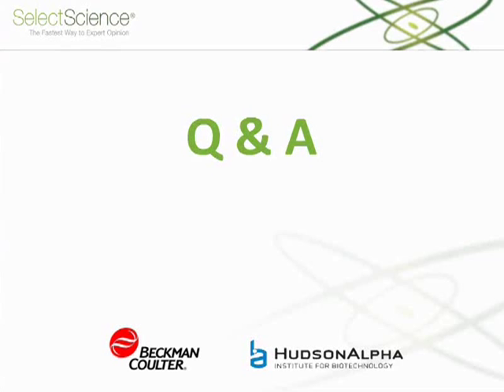I think it may be a good fit for laboratories looking at relatively small numbers of libraries. In comparison to the NuGen robot, it's kind of an apples to oranges comparison. The NuGen robot is very much designed for very, very low input material and very, very small volume reactions, and if that's a primary consideration, the Mondrian is a good fit.